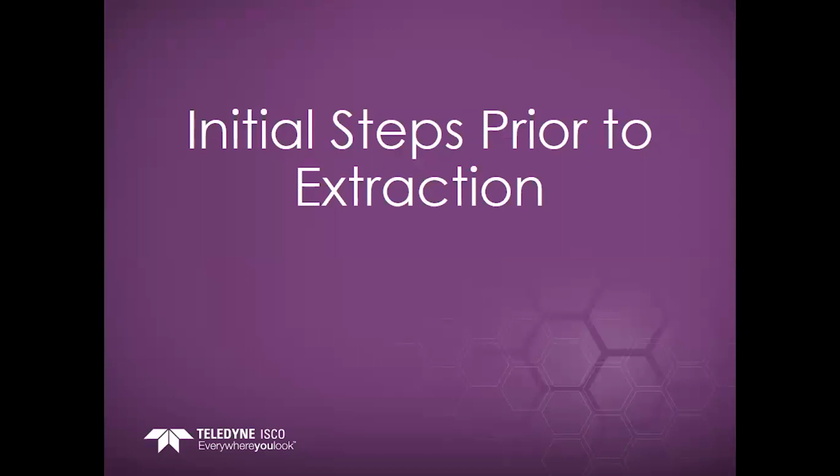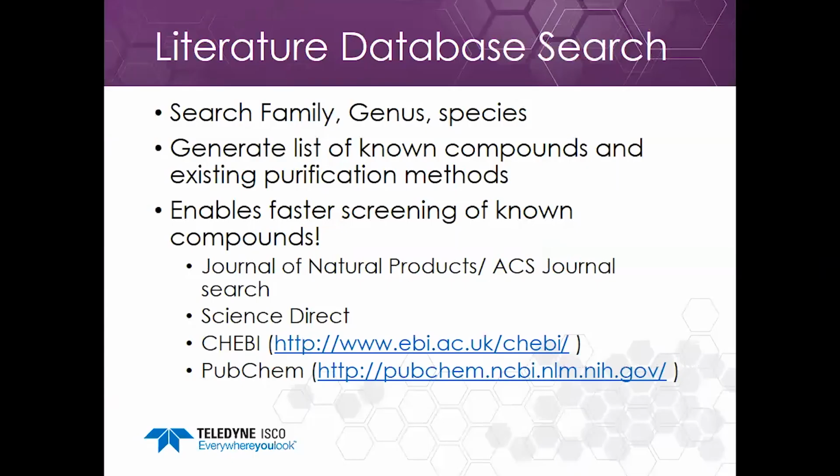The initial steps prior to even extracting anything is to search the family, genus, and species. If you're working with a bacteria or fungi, try to identify what it is insofar as you can. Plants, even at the family level, many families produce similar compounds. Generate a list of known compounds and existing purification methods, and I find that saves a lot of time because we can screen out known compounds more quickly.